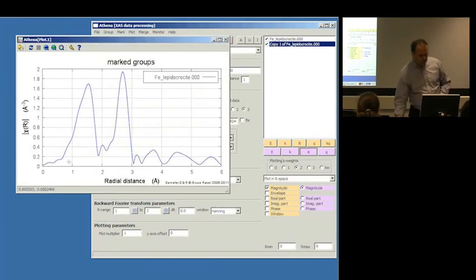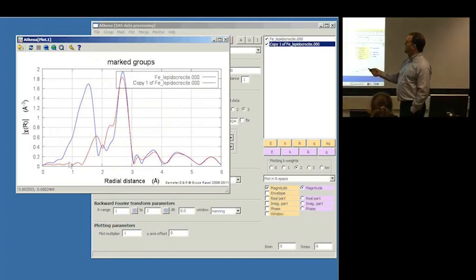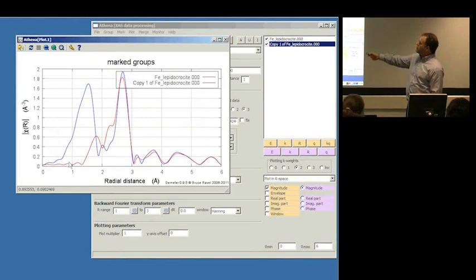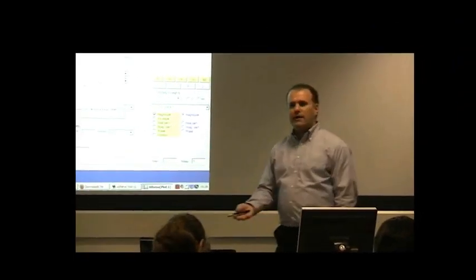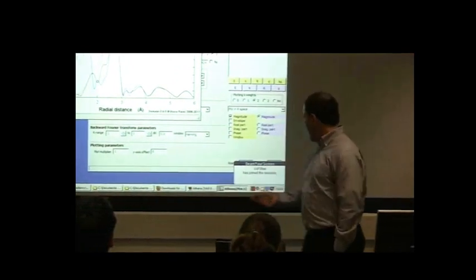And we see now that by choosing a value of 2 for RBKG, we have made a dramatic change to the data in this somewhat low R region. That is, we've completely chiseled out this peak and removed it from the data and had some impact at higher frequencies also. So it would seem that there's a problem with making RBKG too big in that you run the risk of damaging the data.